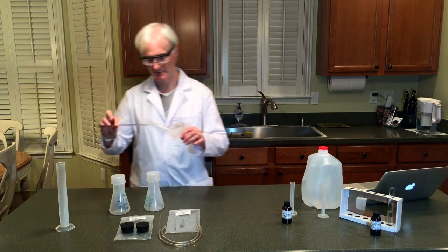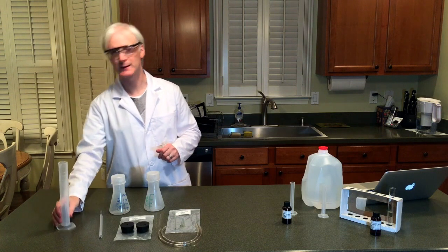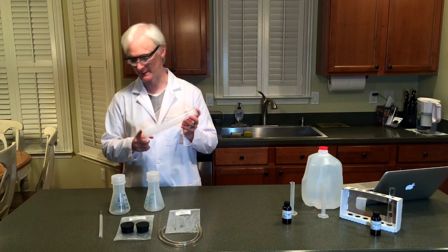Here we have the stirring rod. This is not to be forgotten. The packaging for that can be a little bit tricky, so you'll have figured that out by now, I hope. And we've got the 100 milliliter graduated cylinder.